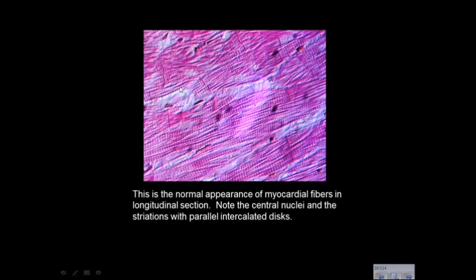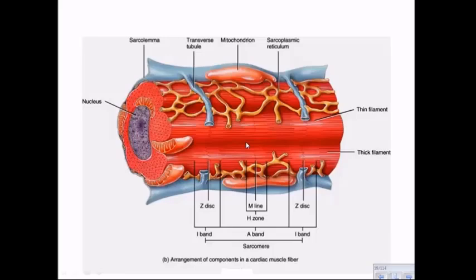So the nuclei in cardiac muscle, they're either oval or round. This is probably a fibroblast. Okay, so here's the sarcomere. It's similar to what was going on in skeletal muscle. So again, everything is fair game with respect to the anatomy, the microanatomy. So the sarcoplasmic reticulum, so here's the terminal cisternae of the sarcoplasmic reticulum associated with T-tubules.